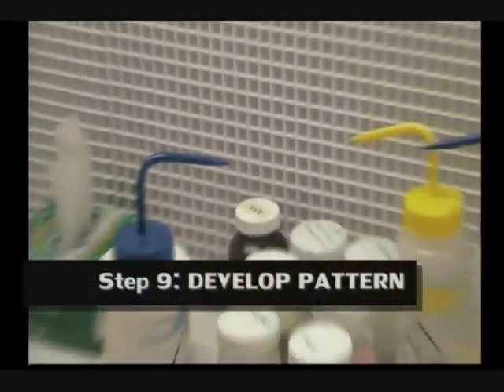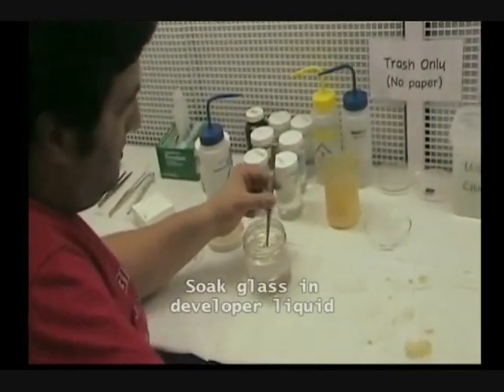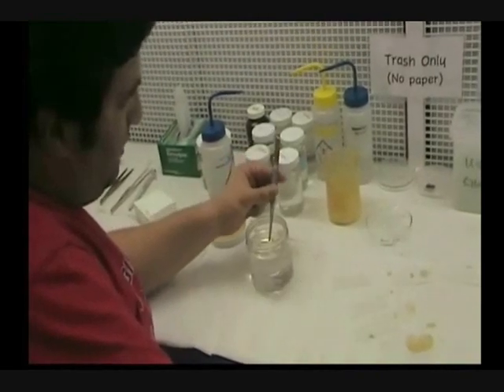What we mean by develop, we are gonna use a special chemical which will remove the unsolidified SU-8 part, which means the part that see the light solidified, and that developer, that special chemical, will remove the parts that didn't see the light. So what we are gonna end up with is a pattern on our glass slide made of SU-8. Now I'm gonna submerge this SU-8 and glass into the developer, which is a special chemical, and it will remove the unwanted parts.